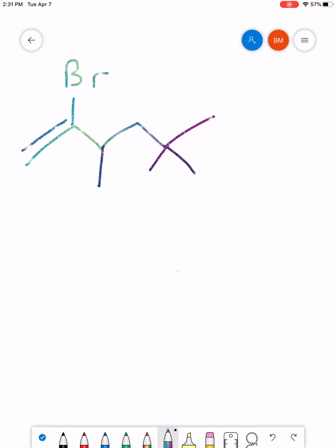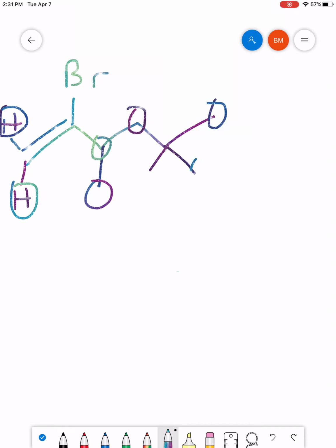All right. Now, again, I'm going through this, and I'm going to see there's an H there, there's an H there. They may or may not be the same. We'll figure it out. But we definitely have that. We have an H here. We have a group of H's there. We have H's there. Here, here, and here. Again, the central carbon in the middle does not have any H's.